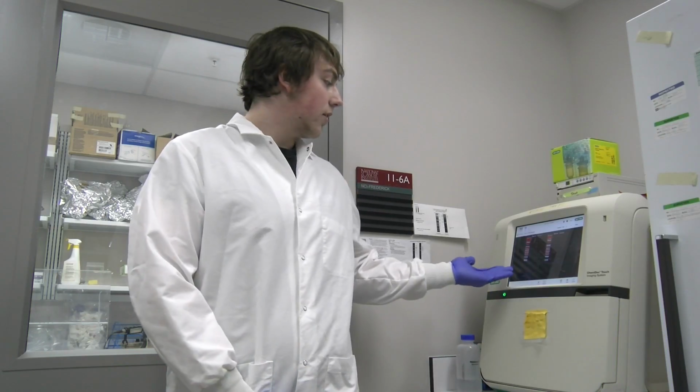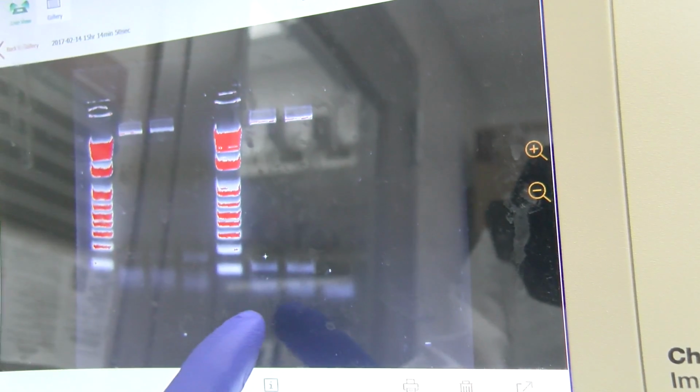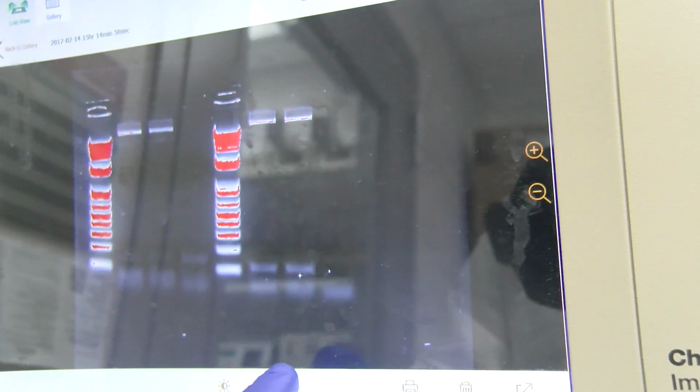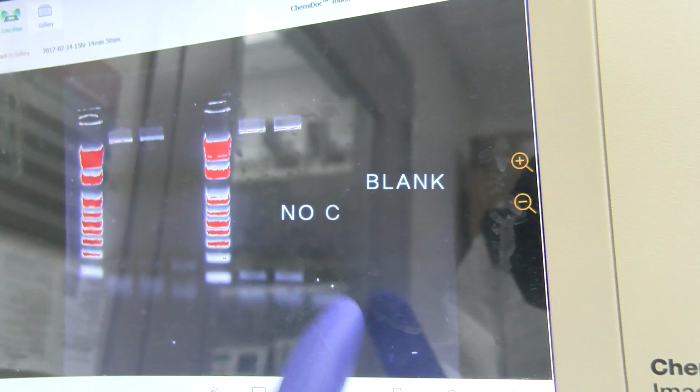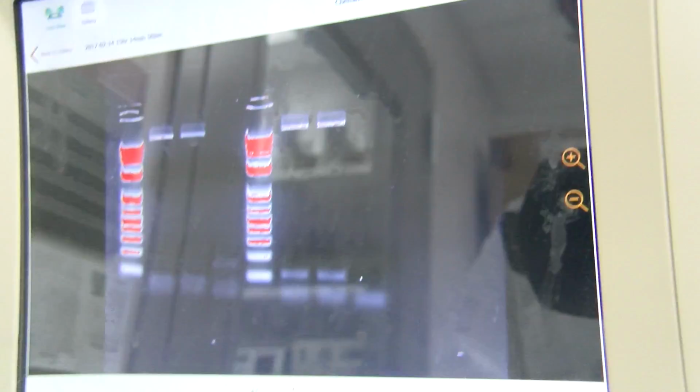As we can clearly see according to our ladder, we have bands that were released at around 200 base pairs, which is what we desire. If we can go over to the blank and positively identify that there was nothing copied over there, then we have successfully replicated and amplified this fragment of DNA.